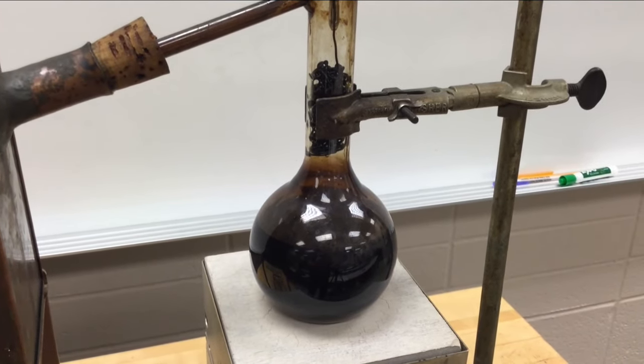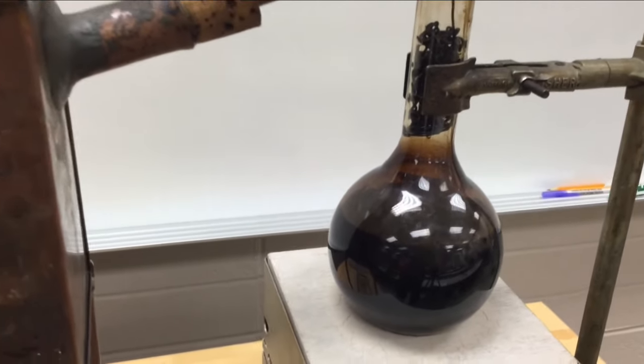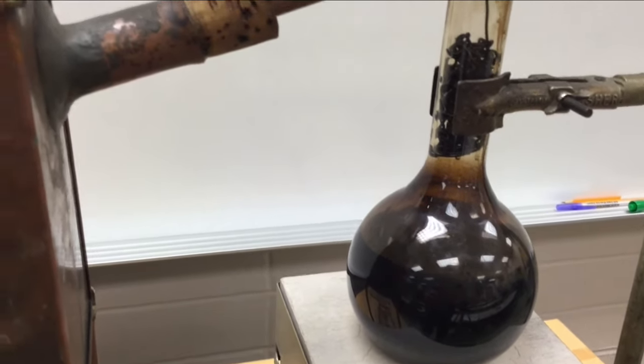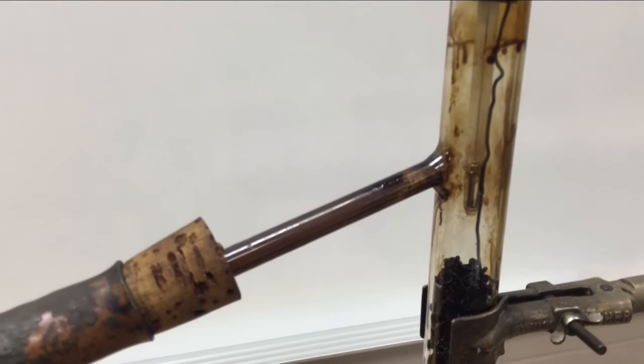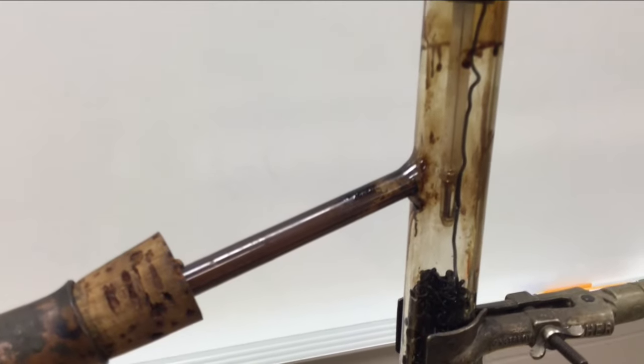Here's a close up of the flask boiling. You can see that the fluid in there, the oil in there, is boiling ever so gently. And we're measuring the temperature of the vapors inside the tube. You can kind of see the position of the thermometer relative to the tube that's running to the condenser. If I take a look up at my thermometer, as you can see, it's a little bit above 200, so maybe 210, somewhere in there.